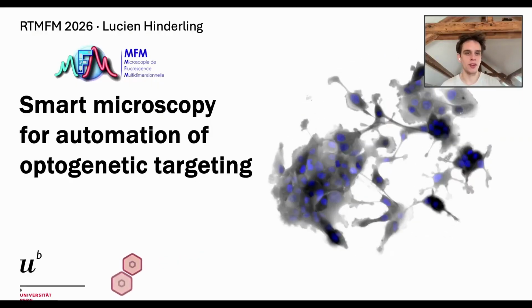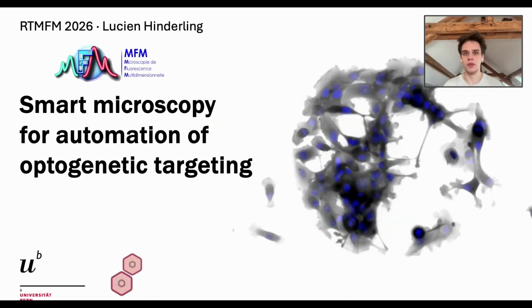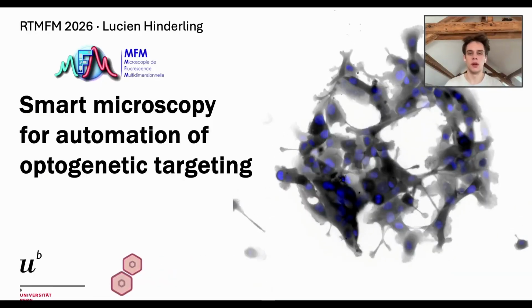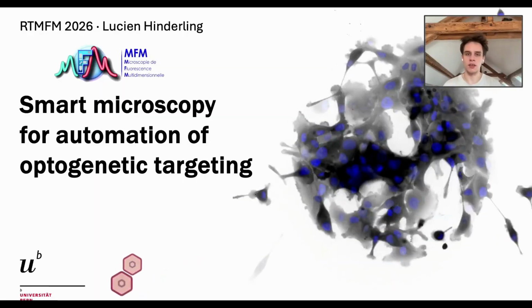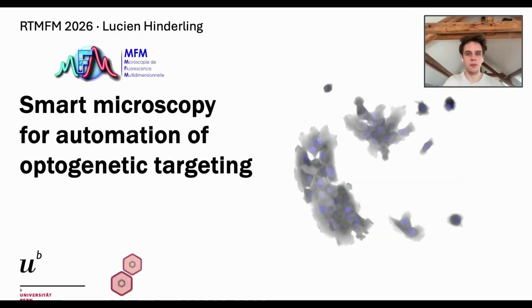And there's a bunch of stuff I want to show you from the biology side and also method development. The platform I already talked about a little bit, but then also have a look more deeply into other smart microscopy applications and challenges, and also have a look into the future, what there might be.